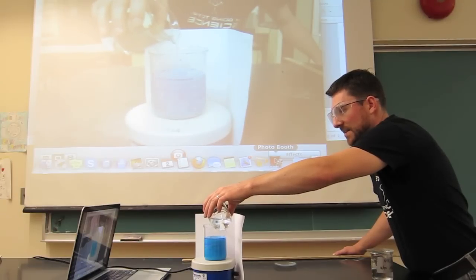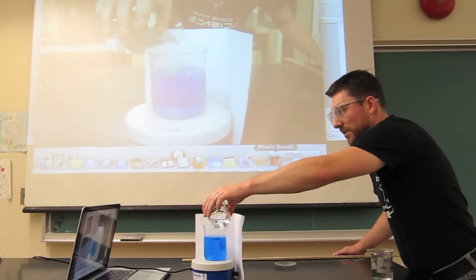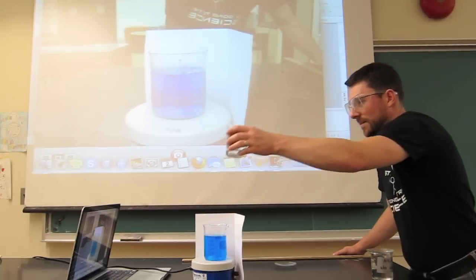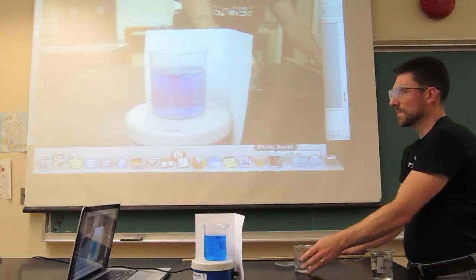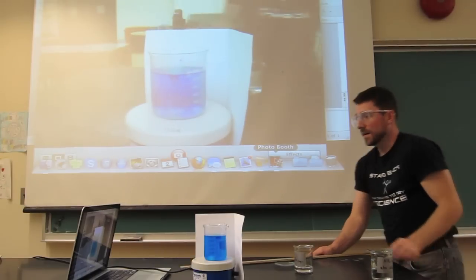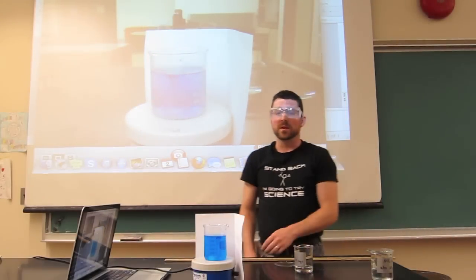We're continuing to add acid. We should continue to drive down the hydroxide, and our precipitate should redissolve. And there's our clear blue copper 2+ solution again. So, I hope you've enjoyed the Equilibrium Blues.